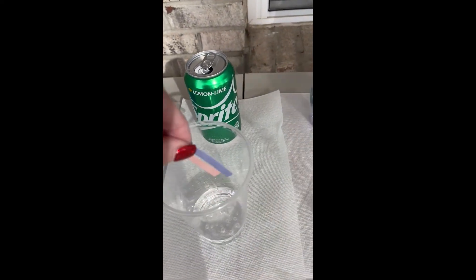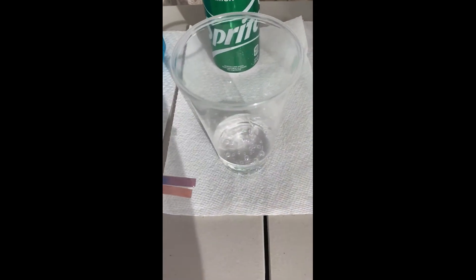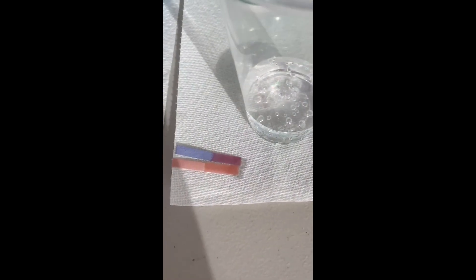Sprite is up next. Go ahead and dip it in. Our blue litmus paper did turn pink, so this is an acid.